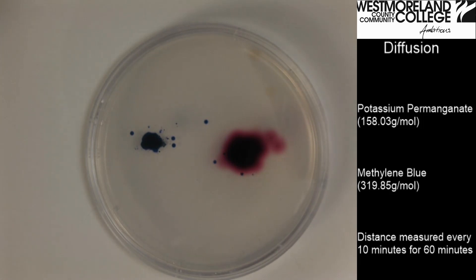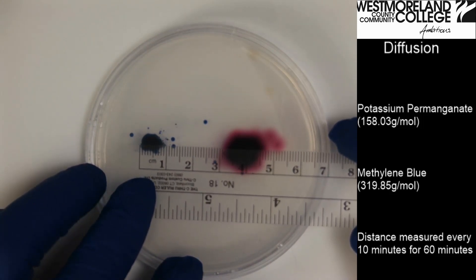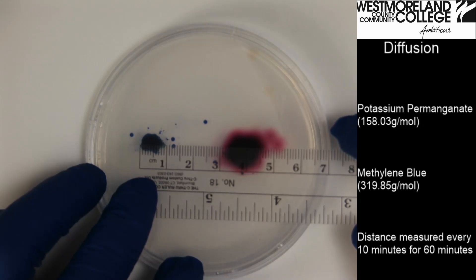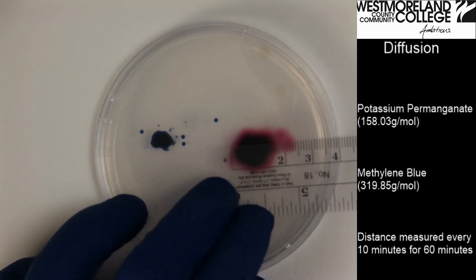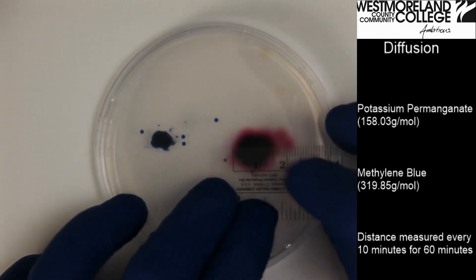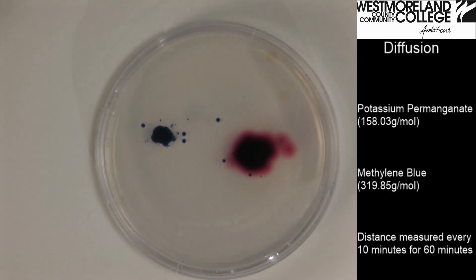It has been ten minutes. I will take another measurement. The methylene blue is at ten millimeters. The potassium permanganate appears to be about 16 or 17 millimeters. I will wait ten more minutes and take another measurement.